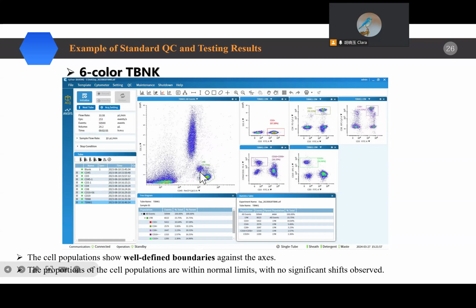And now we can classify the lymphocyte or gather the lymphocyte. And then the purpose of this test item is to figure out the subtypes of the lymphocytes. So we will have a further analyze of the lymphocyte. So here we see the rest figures comes from lymphocyte because we see the title is lymphocytes, means these cells are all comes from here.